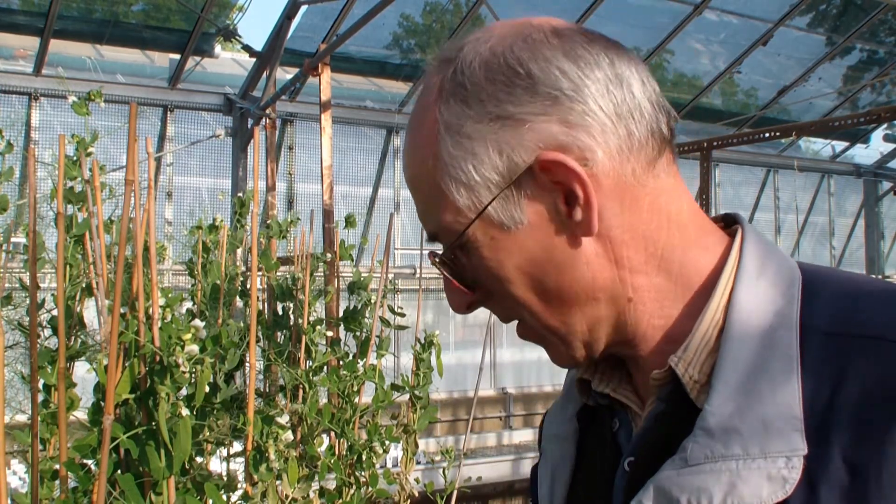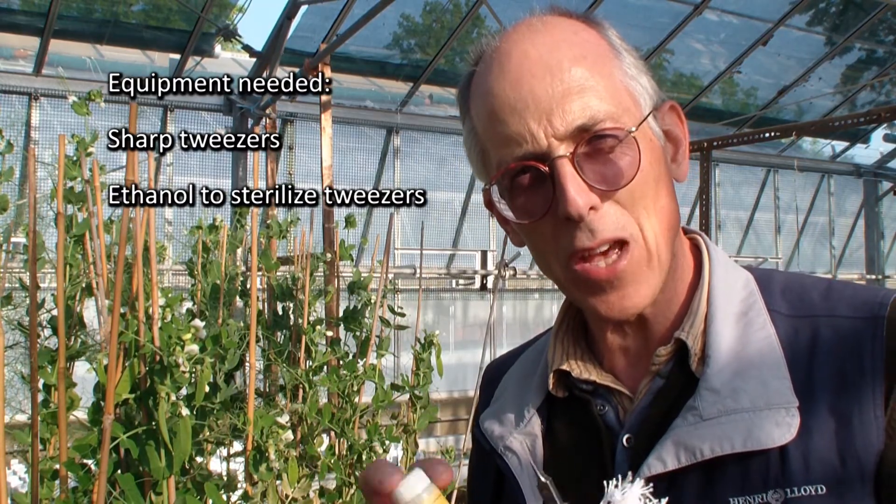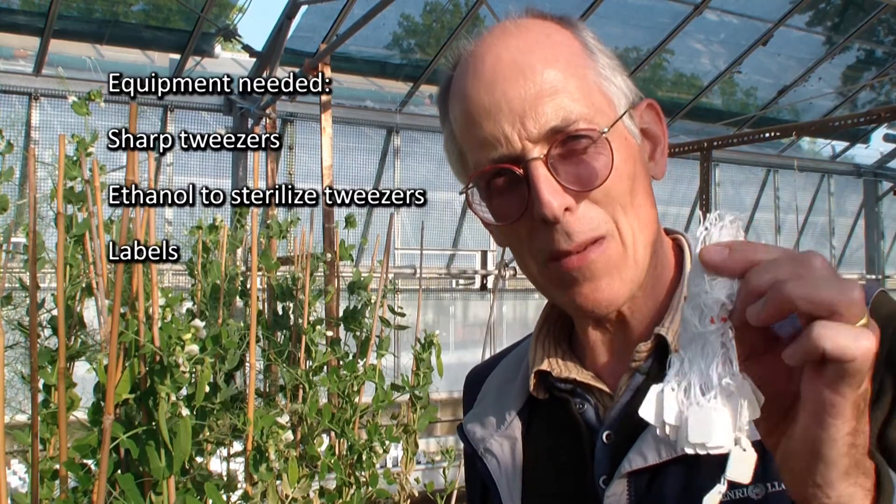I'm going to demonstrate to you what you need to do in order to cross peas. There are three pieces of equipment you need: a sharp pair of tweezers, a small bottle of ethanol in which to sterilise the tweezers in between going between one plant and another, and some labels.